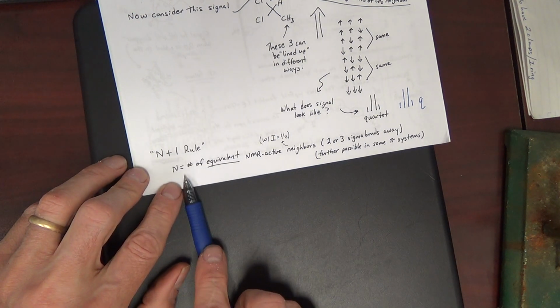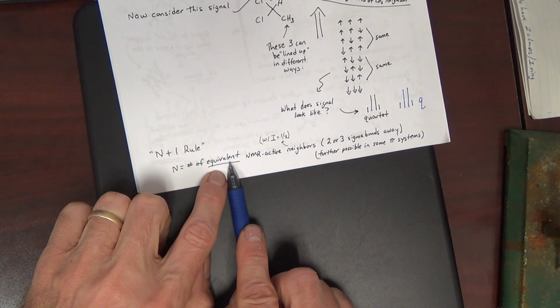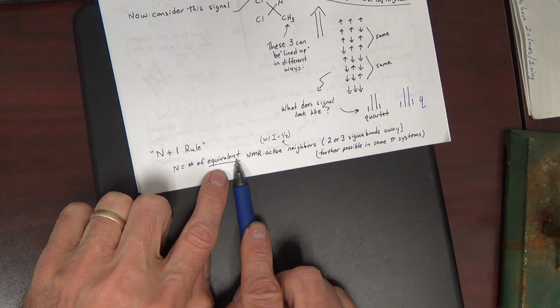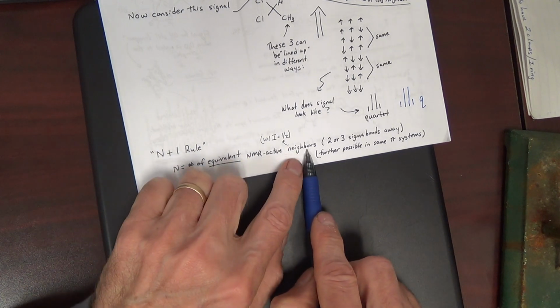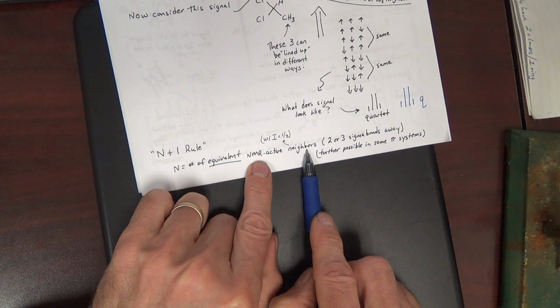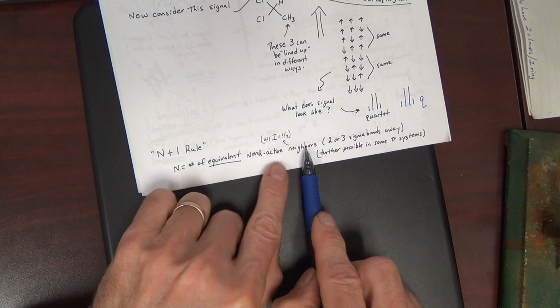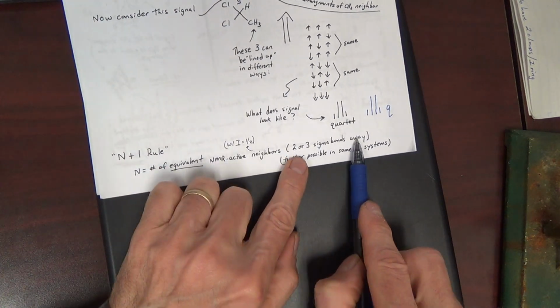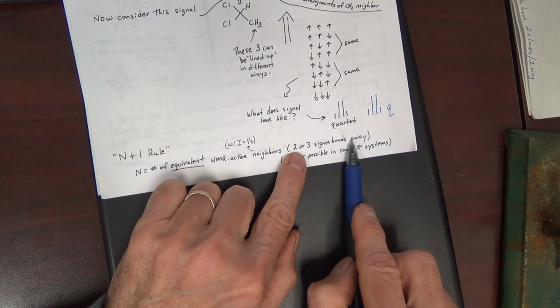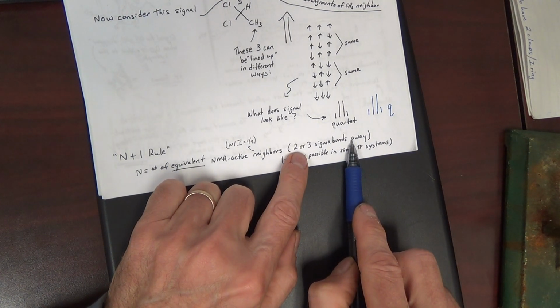In the n+1 rule, n equals the number of equivalent NMR active neighbors. What does that mean, NMR active neighbors? Well, you should know what that means. It means 2 or 3 sigma bonds away from the nucleus that you're studying or probing at the time.